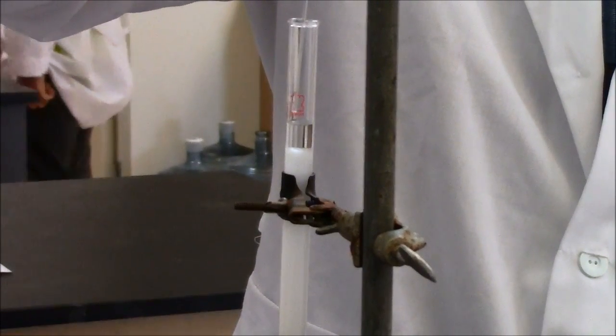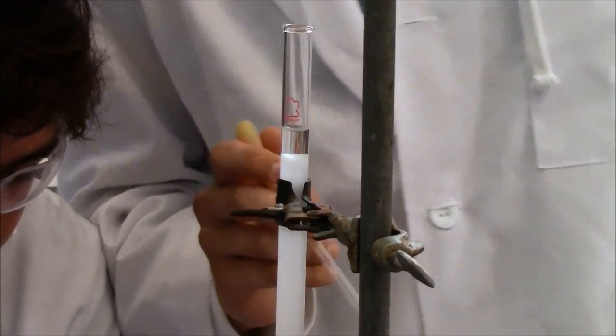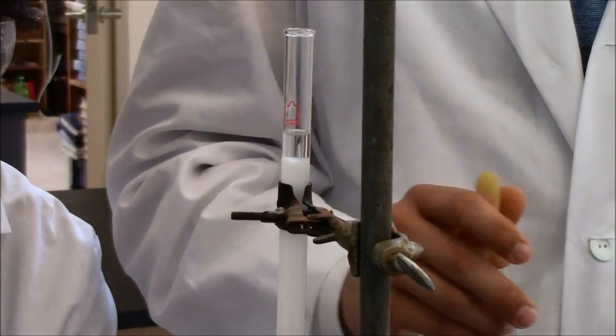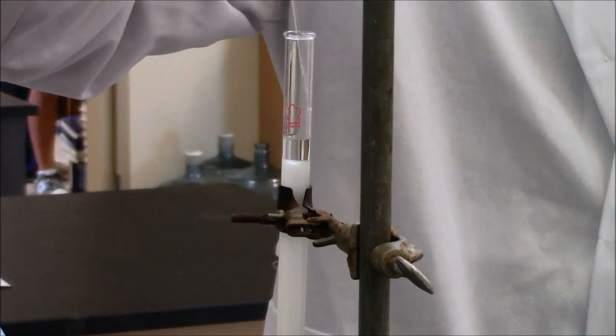Okay, so you can open the tap now, Morgan. And Reese will add more solvent as needed. So we're no longer trying to get it to go beach sand dry. We're trying to say it never gets close to that. There's always a nice layer of solvent on top.